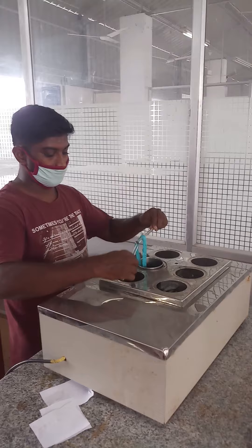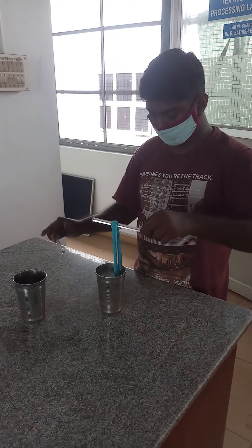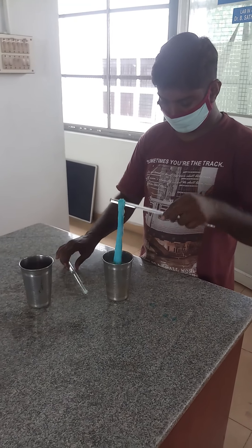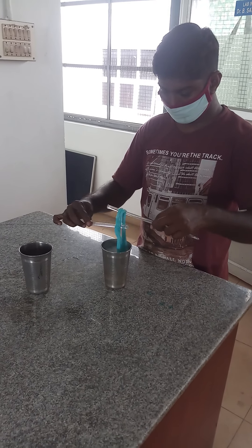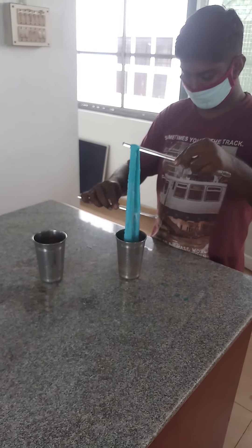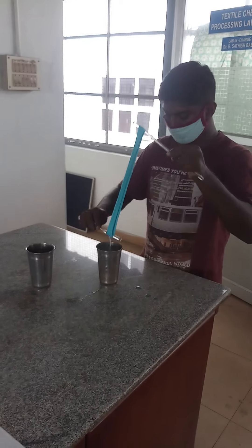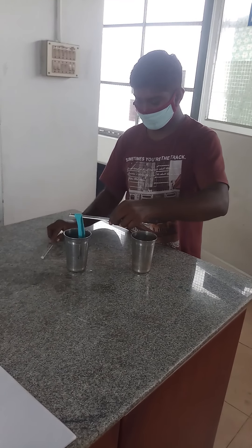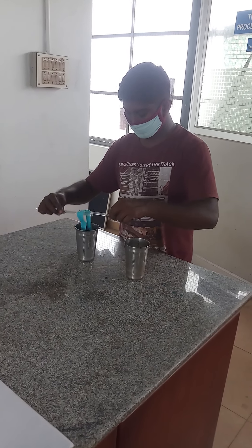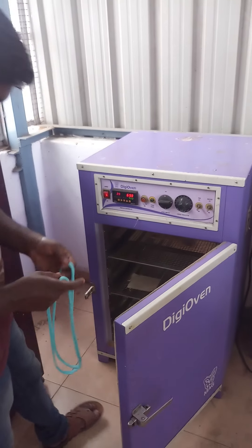After dyeing, the viscose rayon sample should be subjected to washing with cold water, then with soap water, and again with cold water. Finally, the dyed sample has to be kept in a hot air dryer for drying.